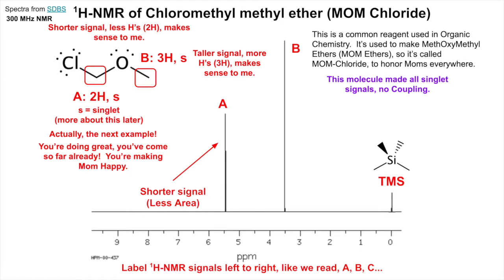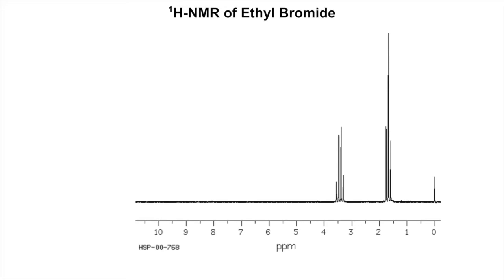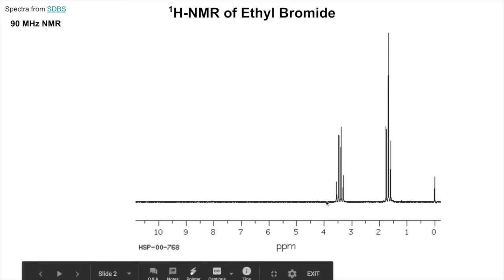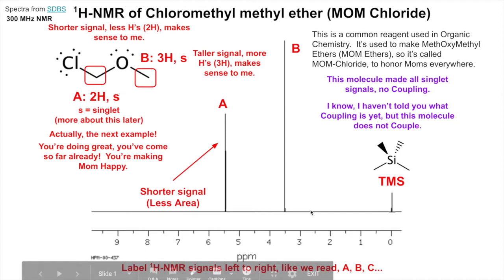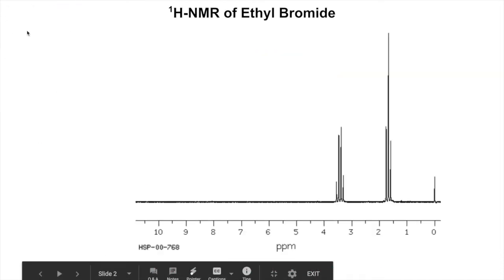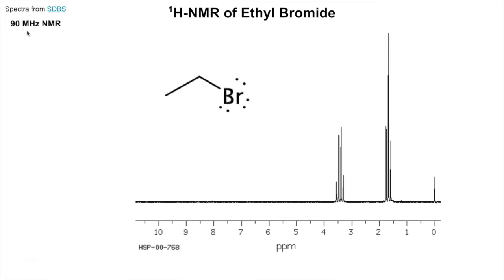This molecule made all singlet signals and had no coupling. Now this is a proton NMR, H-1 NMR, of ethyl bromide from SDBS as well. This one was done on a 90 megahertz NMR - about the same strength as ours. You can see the baseline here - it's not as flat and smooth, it's a little bit rough. That's because it's not as strong an NMR; if this were a 300 megahertz NMR, it would be smoother.